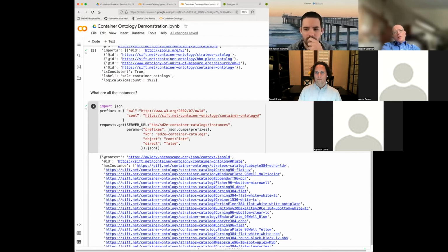I think what I should most do to improve this would be to give a better description of what you can put in here besides container plate, and what the syntax is that you can put in those queries, because those are what you would put in your protocol as well.